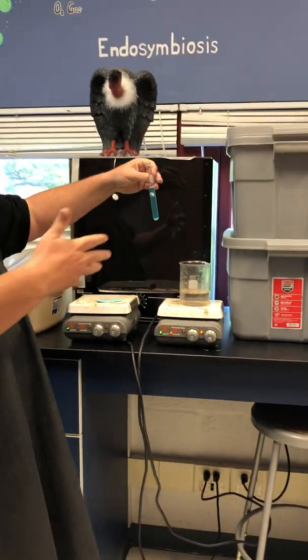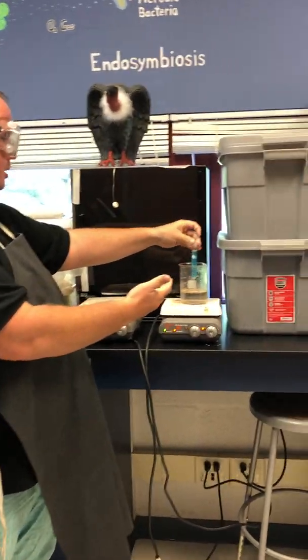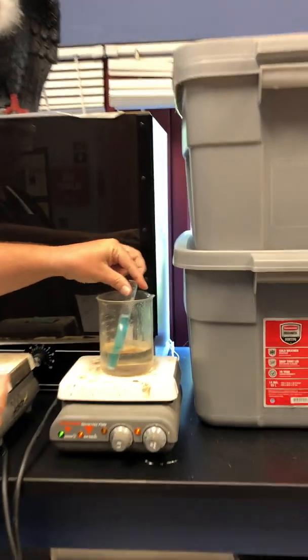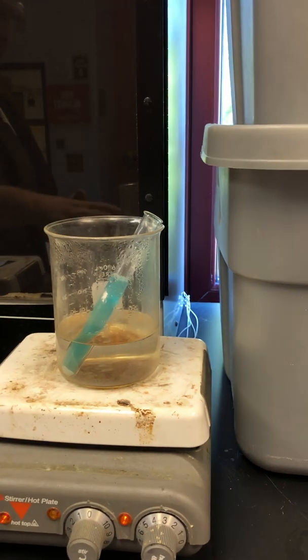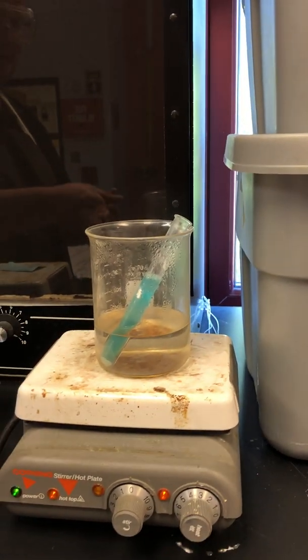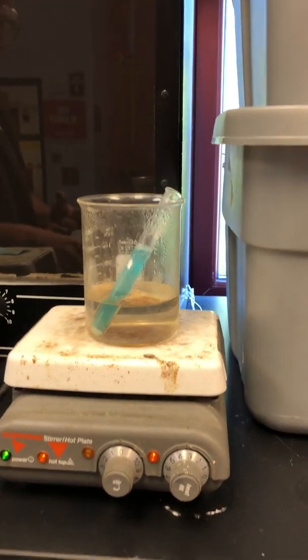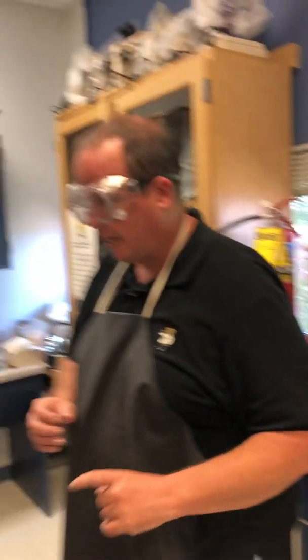We are now going to put this in its warm bath. Please go into your warm bath, relax in there. I'm just going to lean it against the side for a little while as Miss Murdoch puts a warm water bath under it, and this is a little heating thing to keep it warm. So right now we're just going to let this sit here for a little bit, and we'll see if a color change happens.